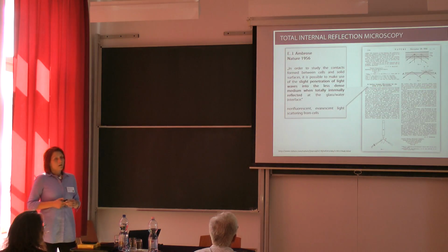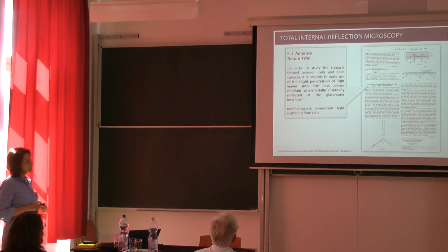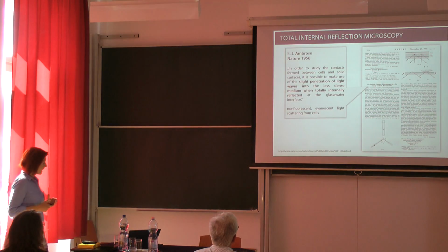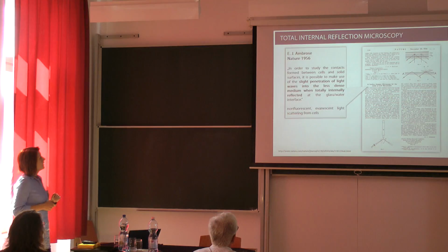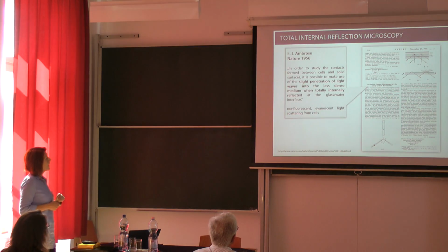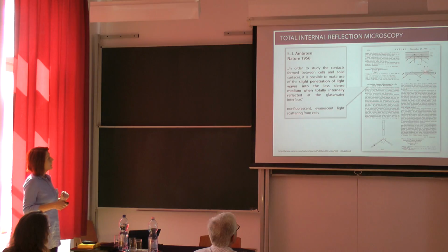So actually the phenomenon, the total internal reflection, was initially used in visible and infrared absorption spectroscopy to study the photophysics of materials near surfaces. To the microscopy, the phenomenon was introduced first by Ambrose in 1956, this is the original publication.